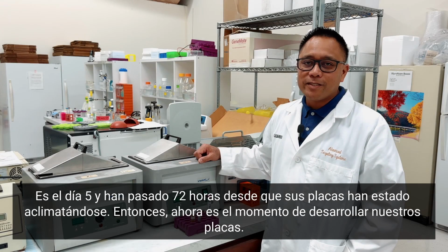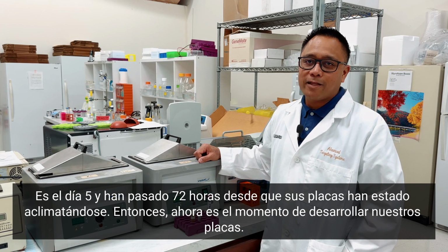So it's day 5 and it's been 72 hours that your plates have been acclimating. All right, so now it's time to develop our plates.